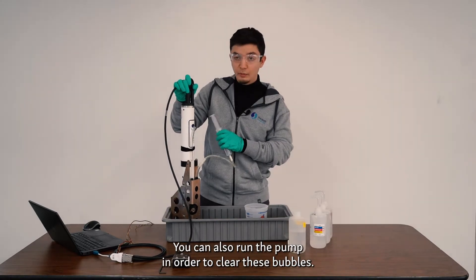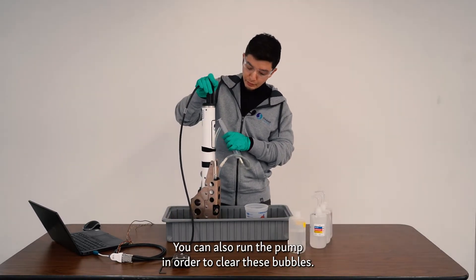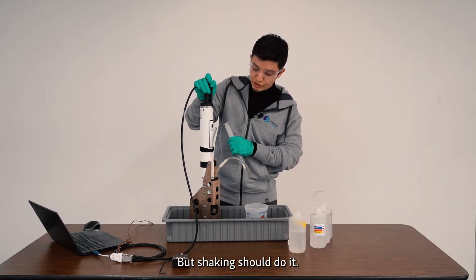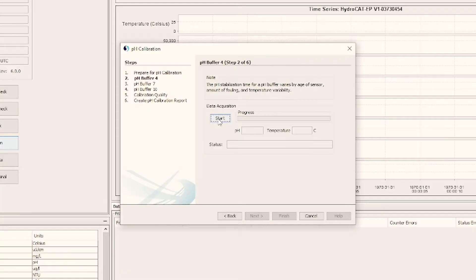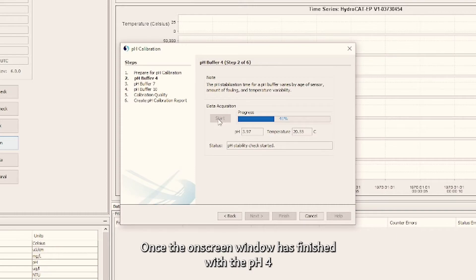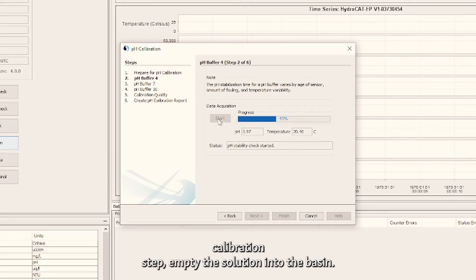You can also run the pump in order to clear these bubbles, but shaking should do it. Once the on-screen window has finished with the pH 4 calibration step, empty your pH 4 solution into the basin.